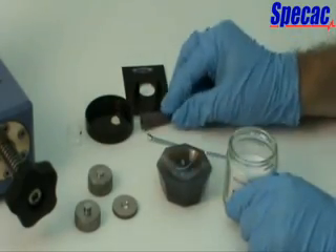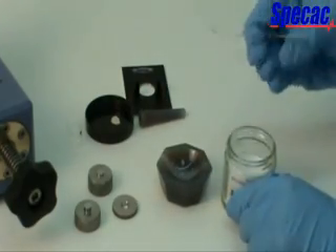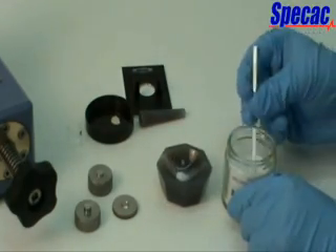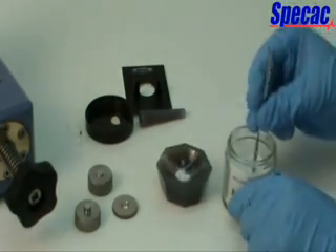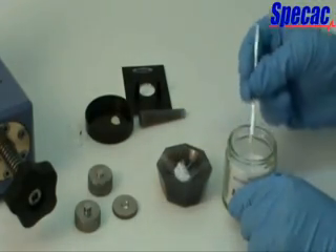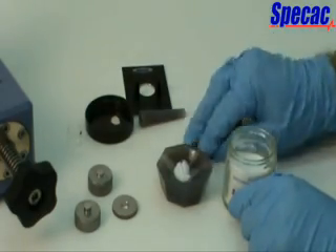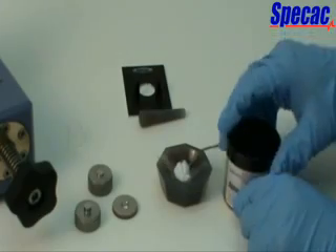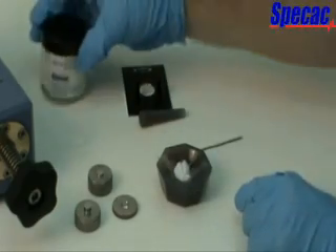Prior to placing the 7mm pellet die assembly into the pressing area of the Mini Pellet Press, a potassium bromide powder mixture with the solid sample is prepared. A suitable quantity of the solid sample with an amount of KBR powder, in the usual ratio of 1 part sample to 300 parts KBR, is ground together using the agate pestle and mortar supplied.